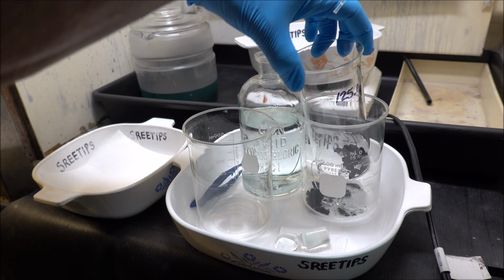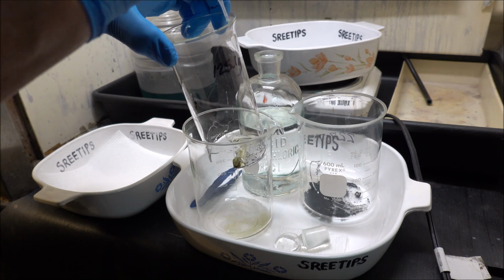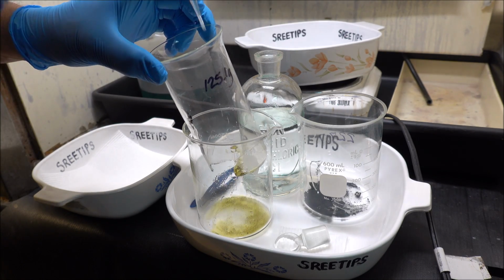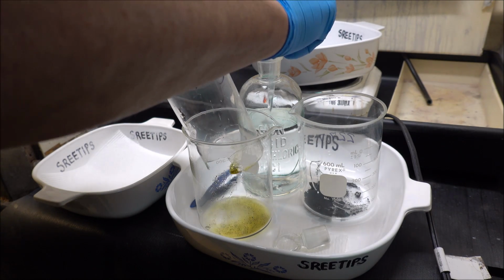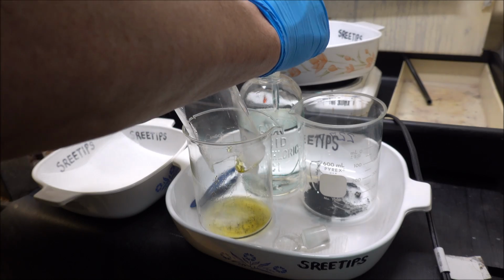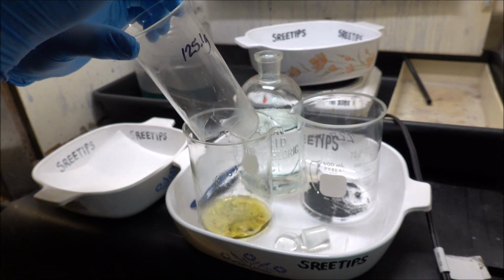There is 7 grams of material in here, if you remember from part 15. And so the critical concentration for this next step is going to be 20 ml per gram of material.